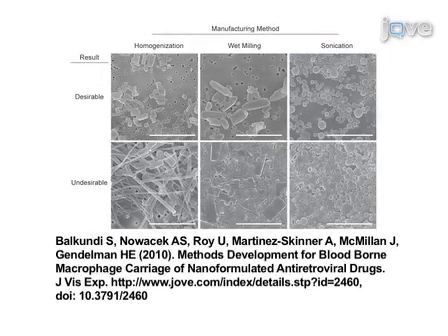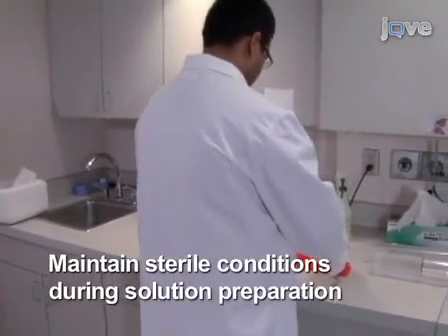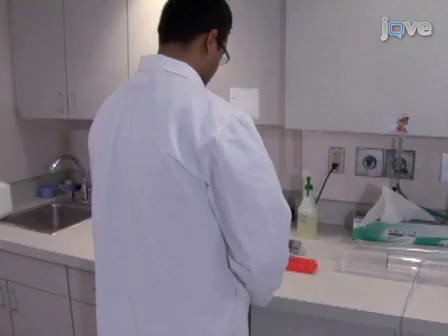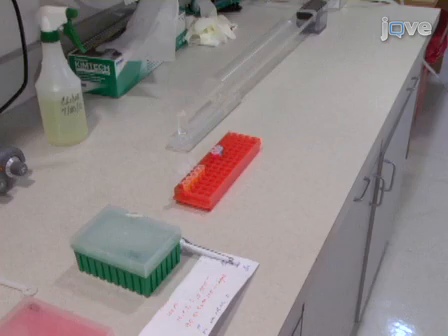First, nanomaterials for drug delivery and biodistribution should be prepared, which is a topic of a parallel manuscript in this issue. First, replicate candidate nanoformulations for in vivo use by replacing the drug core or droplet with an identical sized particle or milled piece of superparamagnetic iron oxide before coating with the appropriate surfactant.